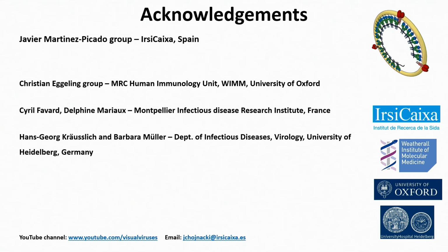And can you please remind me the second question? Sorry. The second question is if the number of envelopes would make an influence in the motility. We also quantitated, these techniques are also quantitative. We quantitated the amount of ENV molecules, and we got to the number that has been previously quoted by cryo-electron tomography, by cryo-EM. We got around 7 molecules.